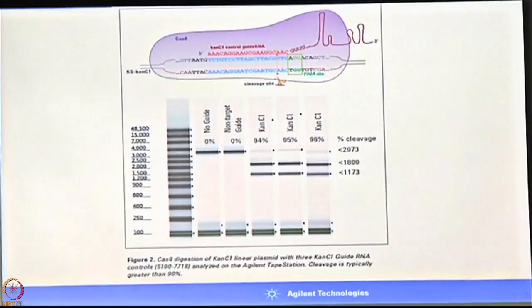When this binds on the targeted part of the gene in the presence of Cas9 enzyme, the gene is cleaved into two parts. In the presence of Cas9, this gene is cleaved, right? This allows five different possibilities again, but mostly it is going to knock out the gene. So if you have one or two genes, you can make a guide in your lab also, right?